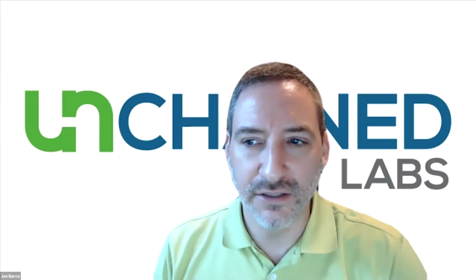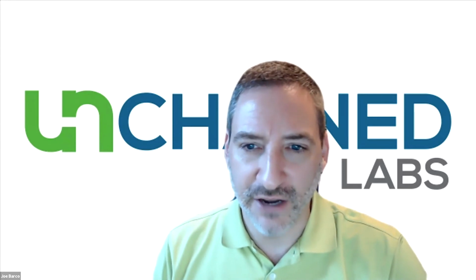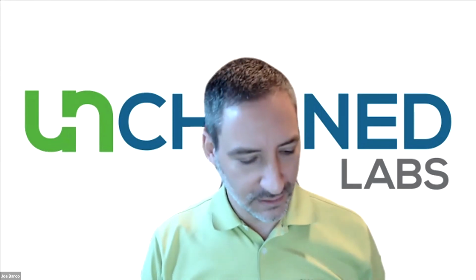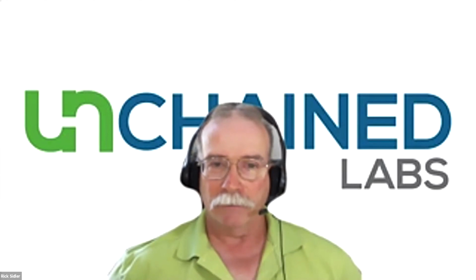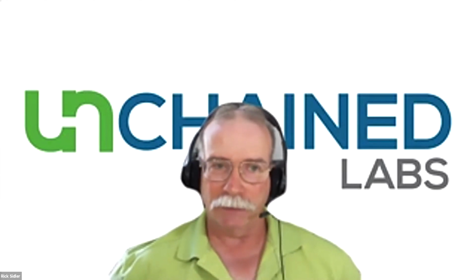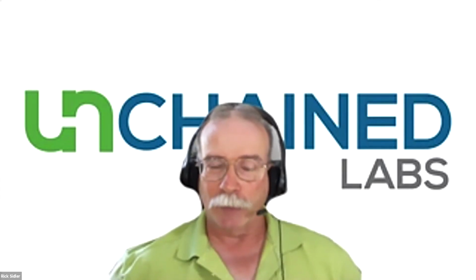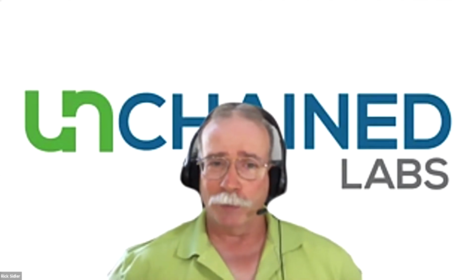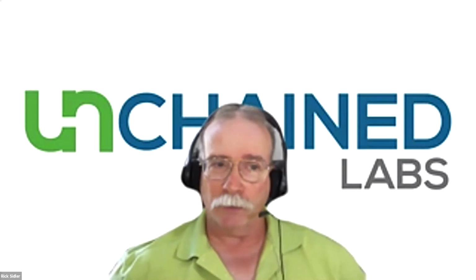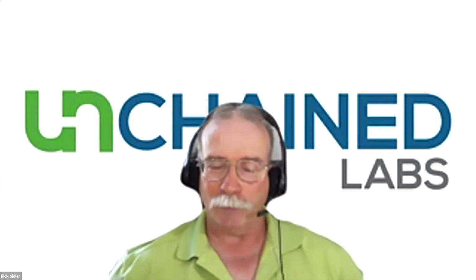Okay, and then can you clarify something with the LEA software? Can that perform the AI and machine learning analysis, and how do people use that in tandem? Yeah, our software doesn't directly allow you to do the analysis for the machine learning and artificial intelligence. But what we're able to do is to provide the structured data as Excel or CSV files from either PolyView or from LEA analysis. Most people, it seems these days, are using open source software programs such as Python or RStudio to perform the data analysis and the visualizations. These programs have a strong user base and community, and they've been pretty widely adopted.